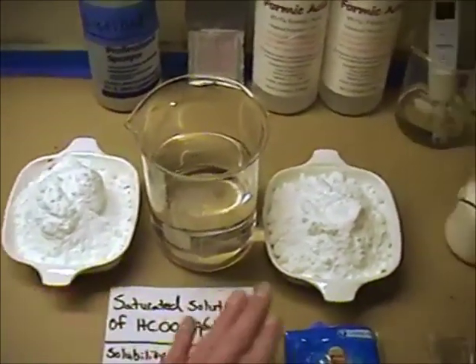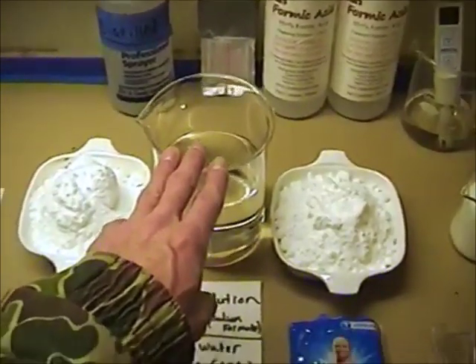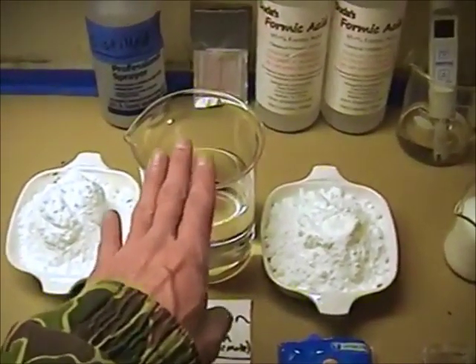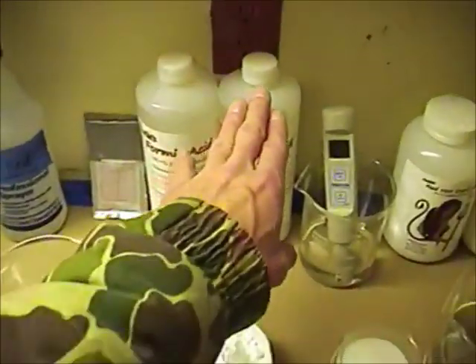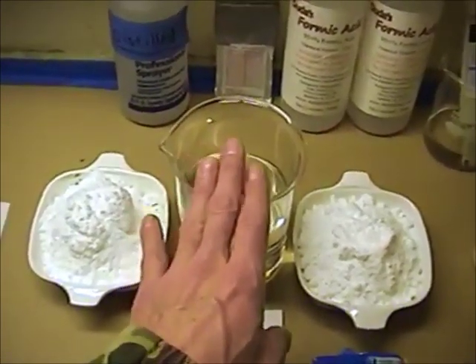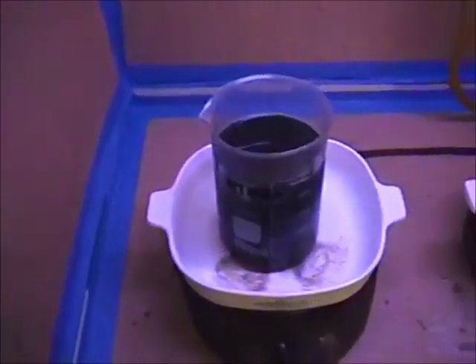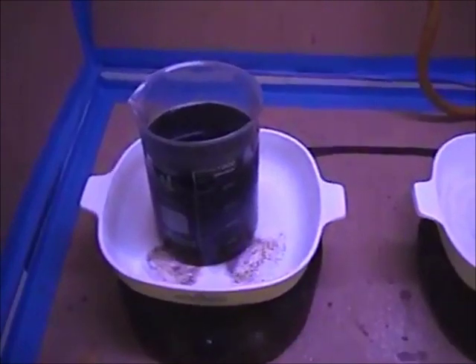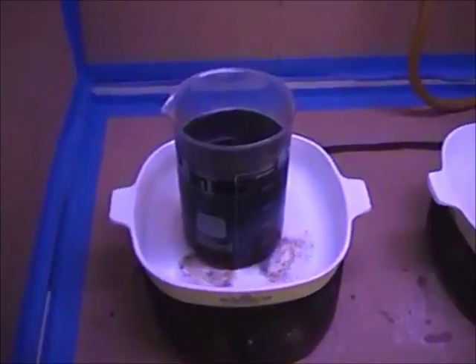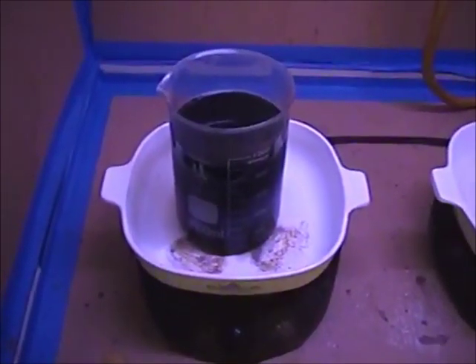After I dissolve the sodium formate into this solution, I'm going to let it cool off to room temperature, which our solubility says we shouldn't have a problem with any crystallization. Once it cools off, I'm going to add formic acid to it to adjust the pH. Then I'm going to filter this and get it ready in preparation for adding to our silver nitrate solution over here to precipitate our silver. And once I finish these processes, I'm going to send these samples out and have them tested for purity. That way I could perfect this process in the future.